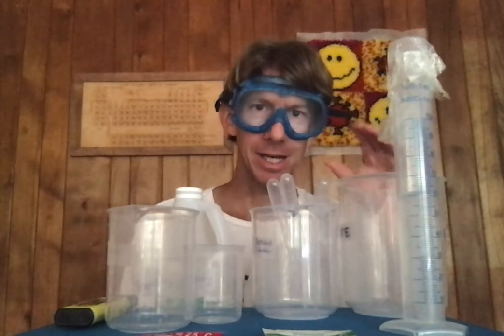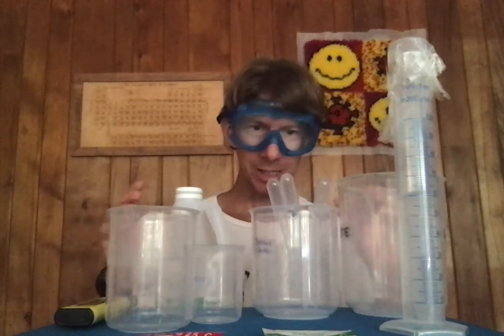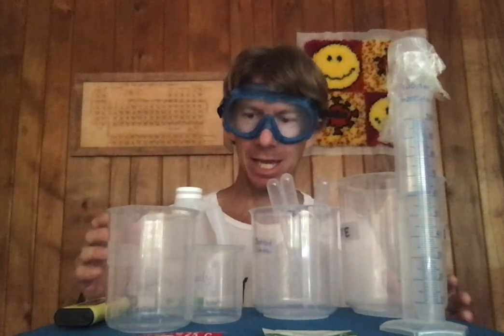Experiment 5, pH titration of acetic acid with sodium carbonate, materials needed. Well, this is the big one, the one you've all been waiting for. We're going to use a lot of our materials. You can see I've got my safety goggles on, and pH titration is the lab of labs, the experiment of experiments in general chemistry. All right, and so going through some of the things that I have here.